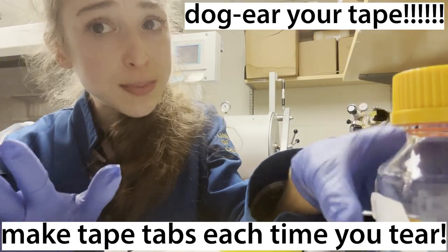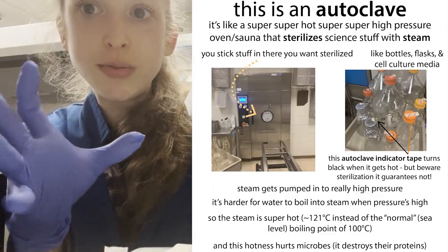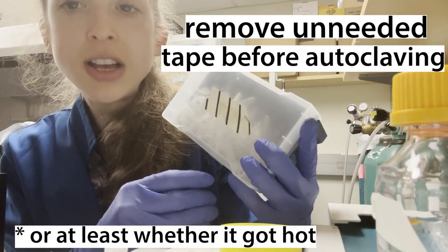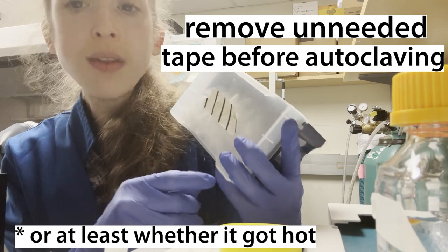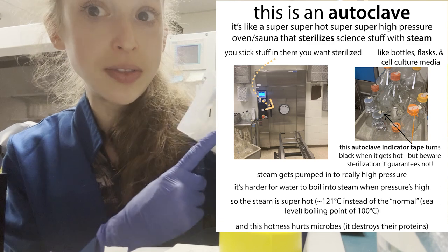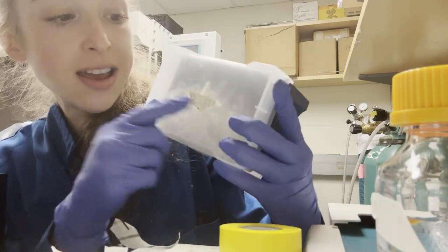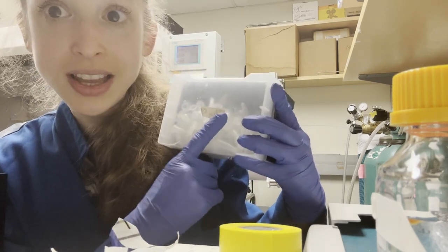The flap is especially important every time that you stick something in the autoclave. The autoclave is a heat pressure sterilizer and it's going to get things stuck on very tightly. So first off, don't put any tape in the autoclave that doesn't need to be there — take off old labels before you put them in or it's going to be really hard to get them off. For the autoclave tape itself, that has to go in because it's what tells you if the thing is sterile, and you're going to want a flap on it so you can pull it off.